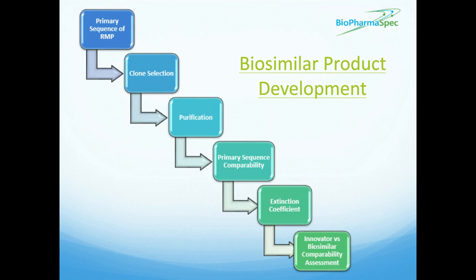So, as Chris very nicely put, this is the basic pathway of a biosimilar product development as we see it in BioPharmaSpec. What I'm going to do over the next 40 minutes or so is hopefully take you through the steps that are particularly relevant to higher order structure and discuss with you how I see things and where we as BioPharmaSpec see the importance of where you should be doing your higher order structure analysis alongside the primary structure and the physicochemical analysis that Chris has described.